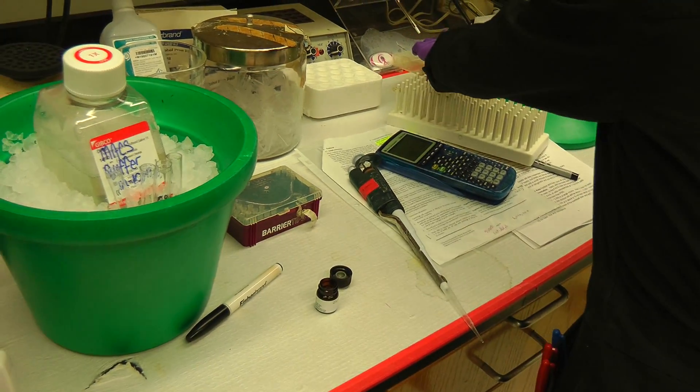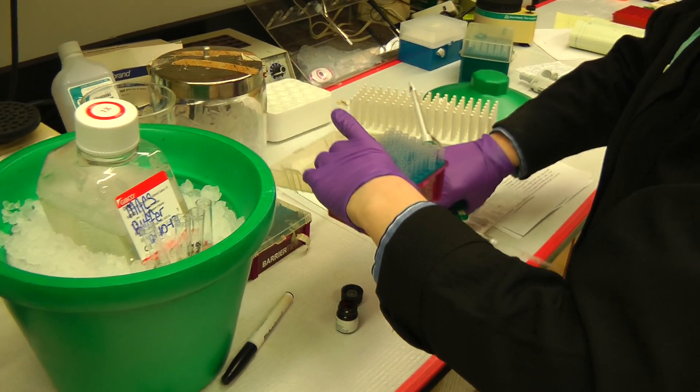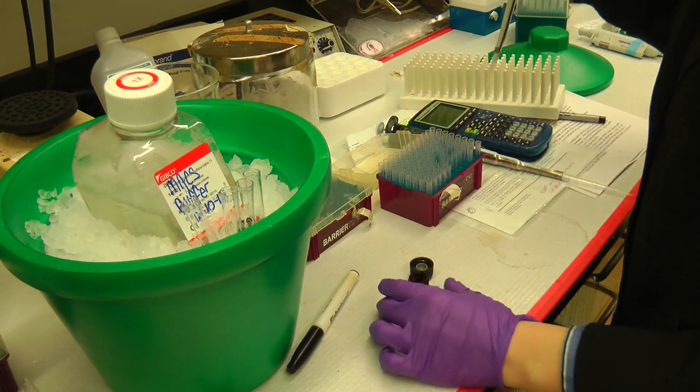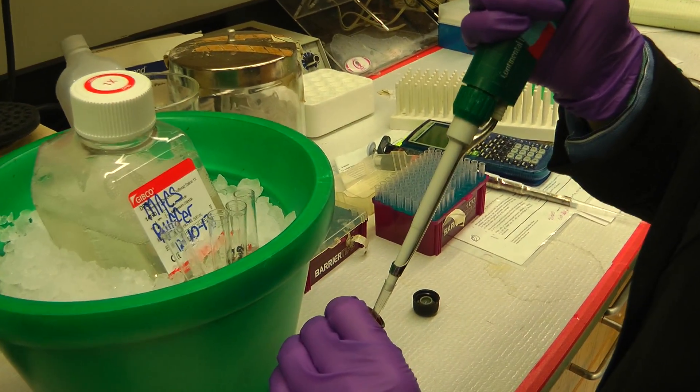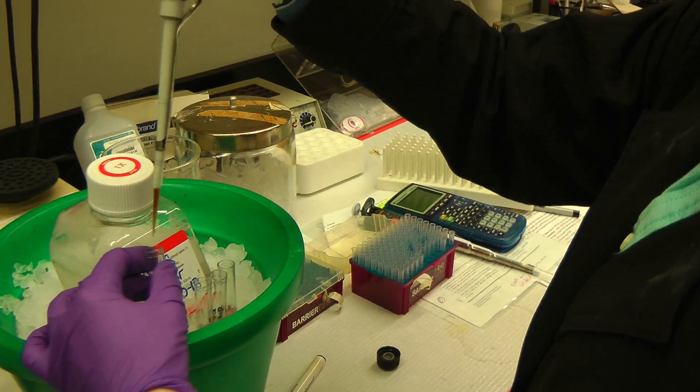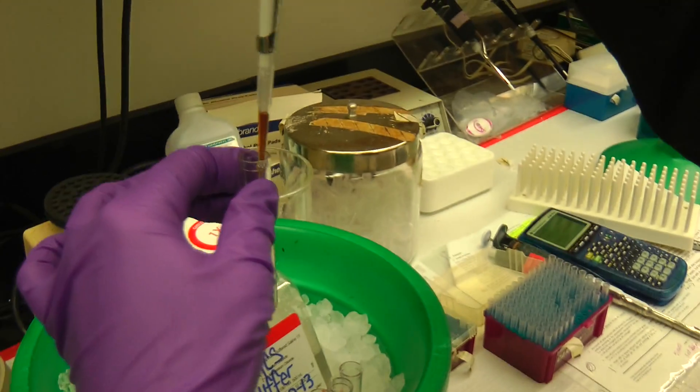And even though it says it should be more — how many cells are there? There are 3 times 10 to the 8th. 10 to the 8th, okay. And there go the max beads.